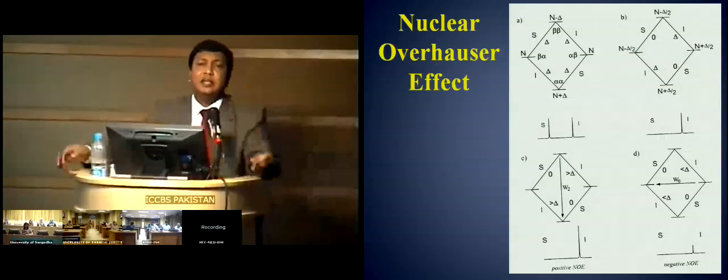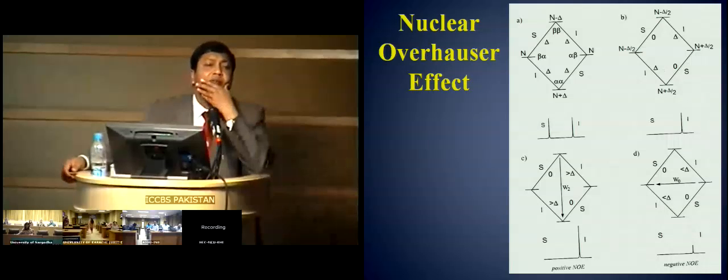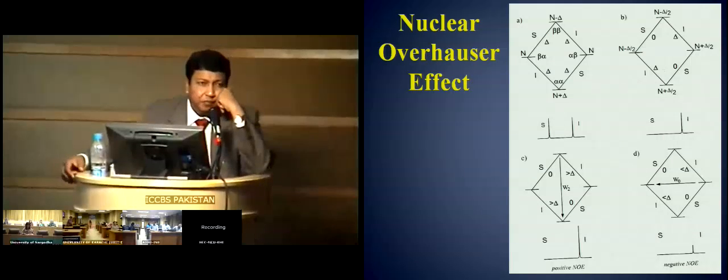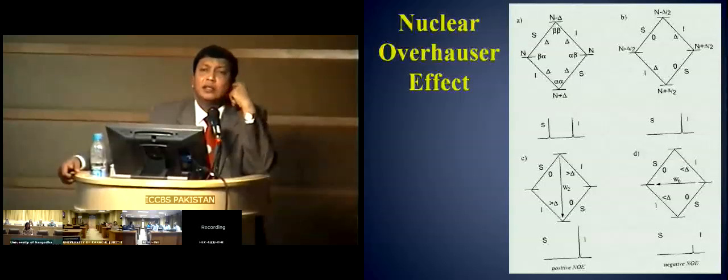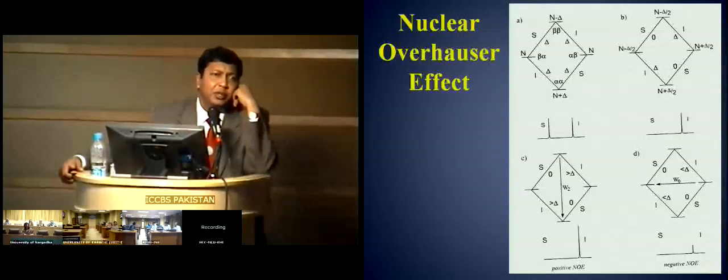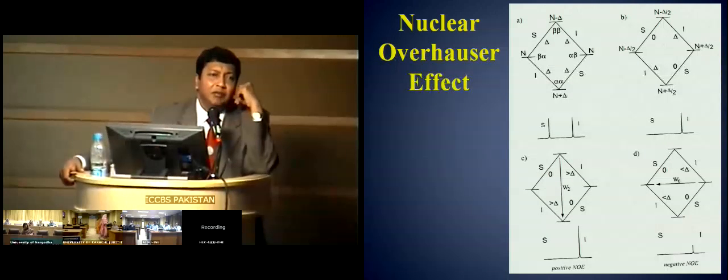If you synthesize a compound, I have synthesized a compound, and after NMR, the natural abundance of C13 is very small compared to C12. Then how do we determine the exact structure of that compound? You need to have a little bit more quantity of sample, and then whatever C13 is in natural abundance, 1%, by polarization transfer, you would be able to see the C13 spectrum. Every carbon, because the probability of finding a C13 on every carbon is equal actually.